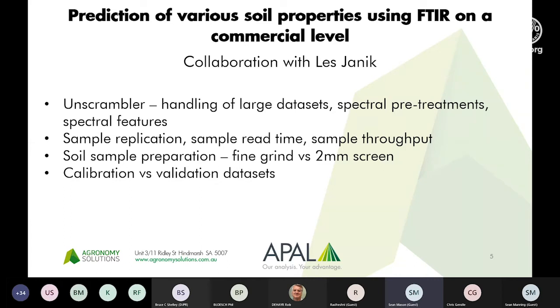And obviously the calibration versus validation data sets, picking the right validation data sets, has been touched on. The beauty of having 10 to 20,000 samples in your calibration database is that you can hopefully get the scope of clients' samples that are coming through the lab currently. So that was the commercial level. Hopefully that's an insight. And Les was great. Occasionally we have to call on Les if an issue pops up, but that was a great 2 year insight to really building up this powerful instrument on a commercial level.